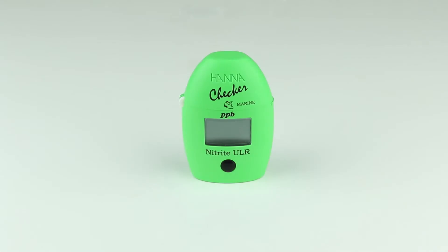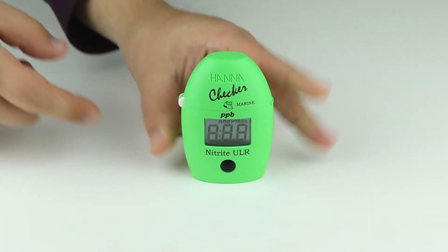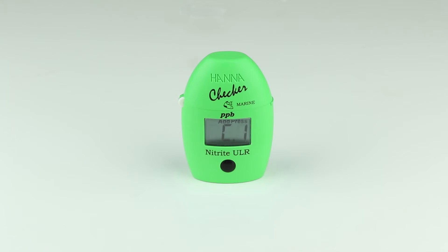The HI-764 is designed to make testing quick and easy. Press the button to power the meter on. Notice ADD-C1 appears on the screen. You are now ready to begin testing.